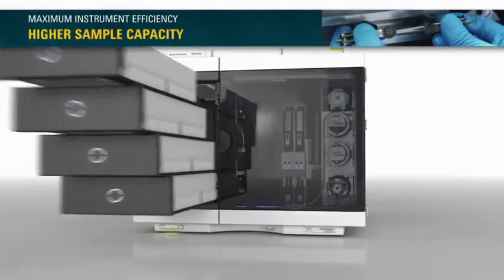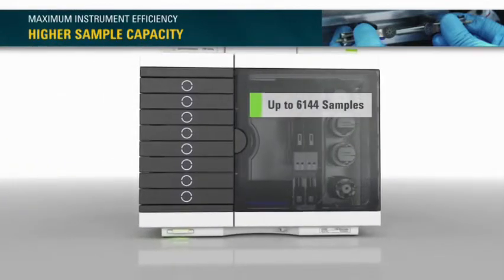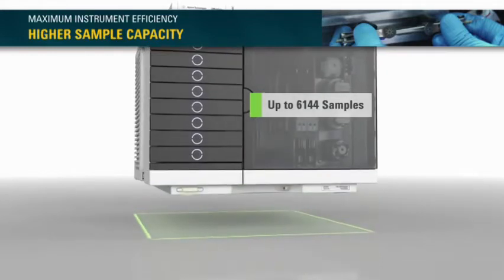Fitted with eight shallow drawers, a total capacity of up to 6,144 samples is possible, all within the footprint of a standard Agilent LC stack.